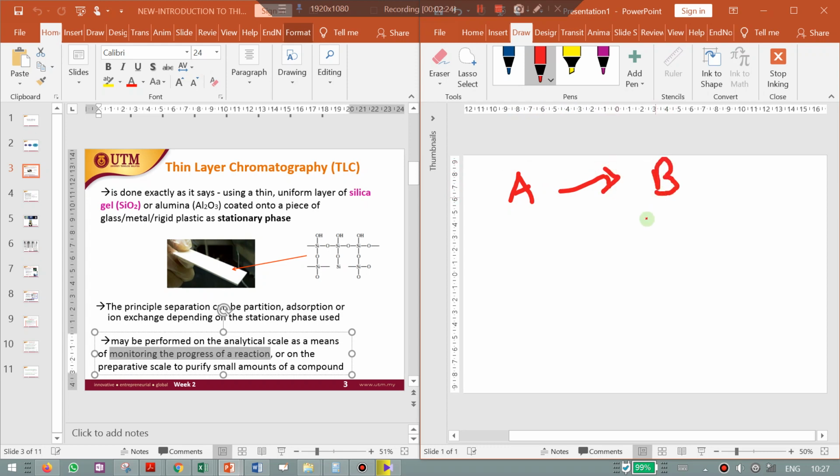You want to extract. Maybe you do the stirring process or the mixing process and you measure the time taken. For example, within 2 hours with 30 minute intervals, you want to know at which time the reaction is complete. At which time is the reaction already complete?